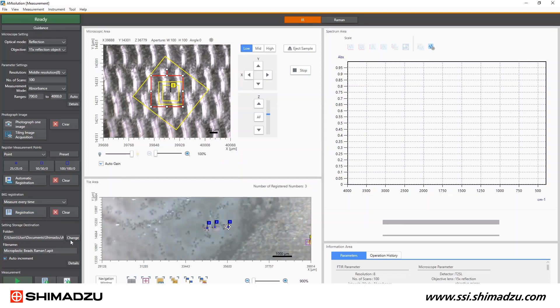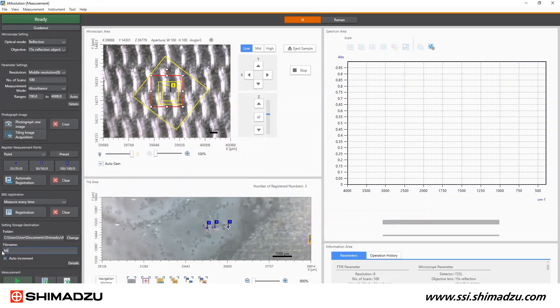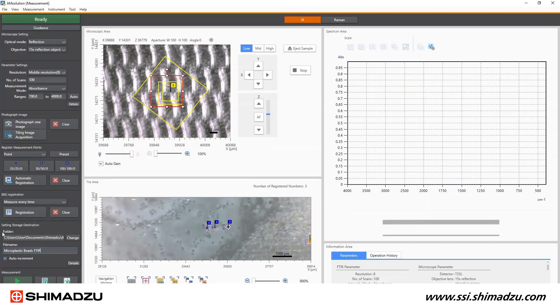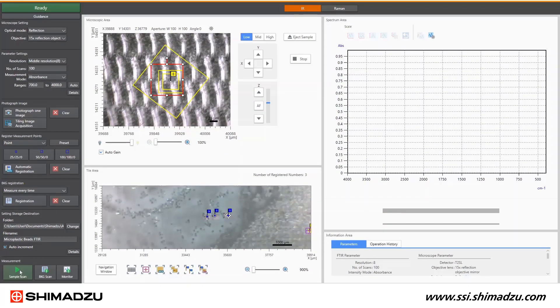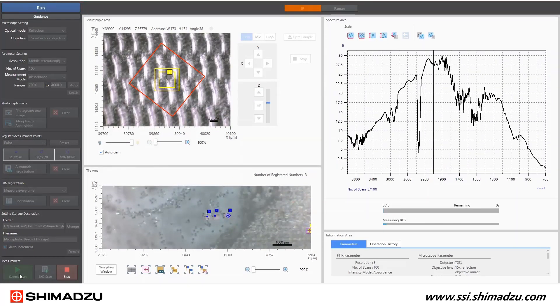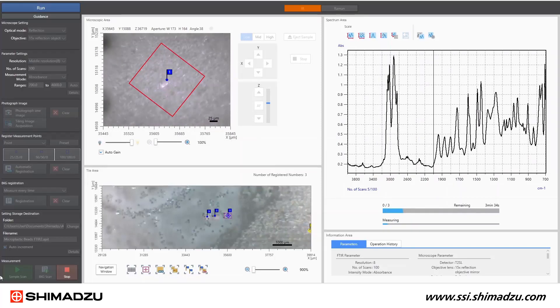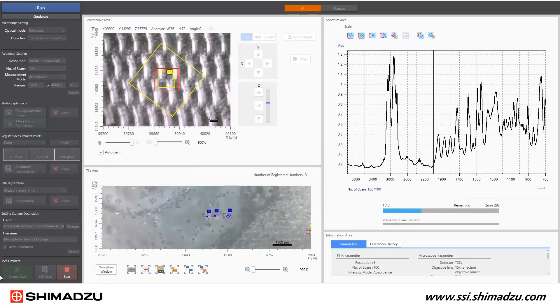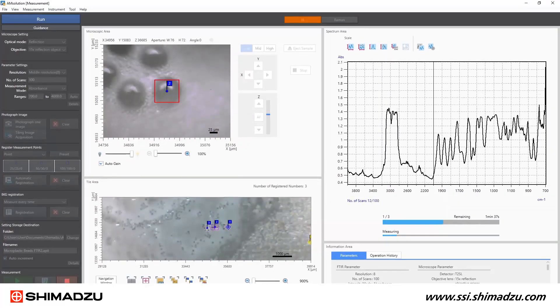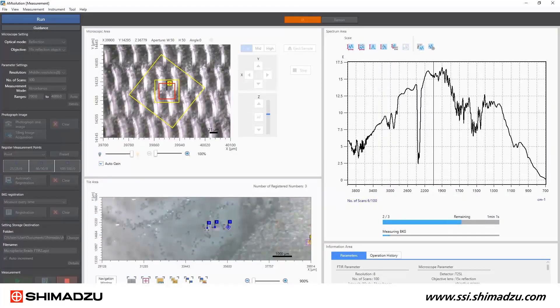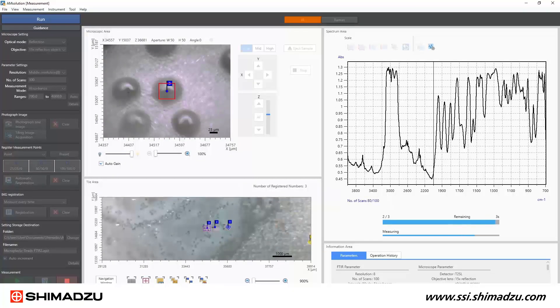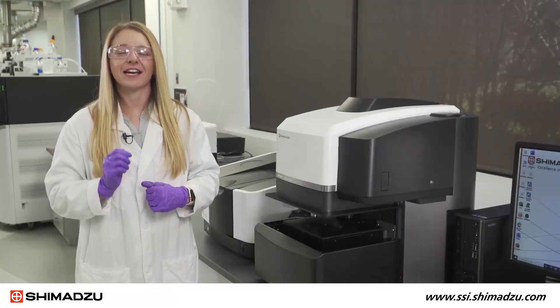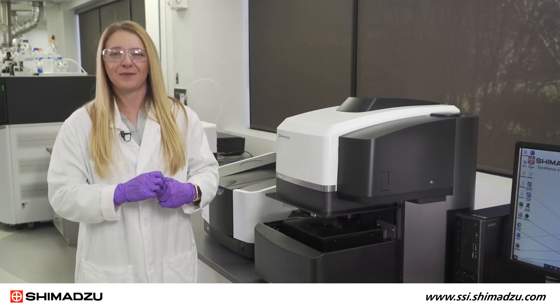The last step in the FTIR measurement setup is selecting what to name the data and where to save it. I like to check this auto-increment box so the data is saved with an ascending number at the end of the file name. Now that all of the images are captured and the points are registered for the FTIR microscope, I can click the green sample scan button at the bottom and the AIRsight will automatically move to each point and collect FTIR data.